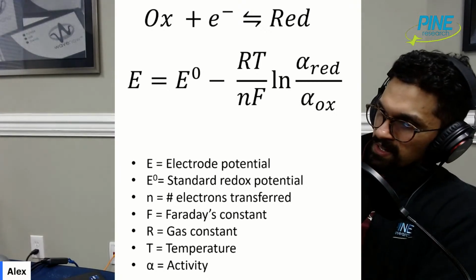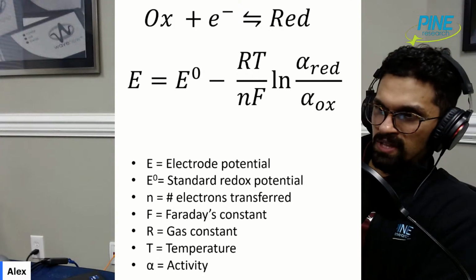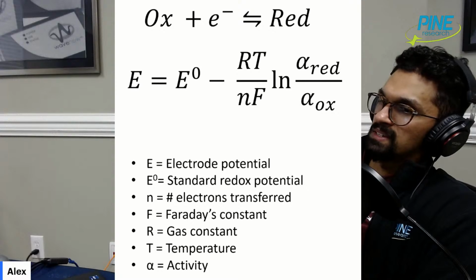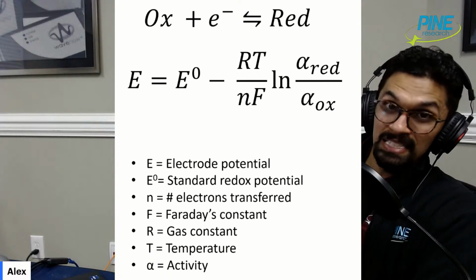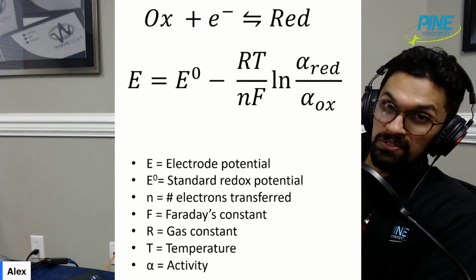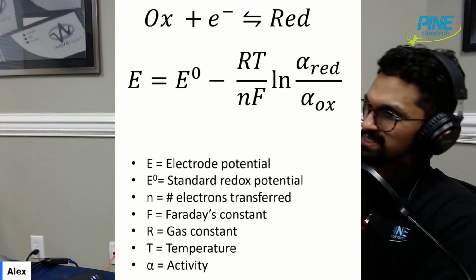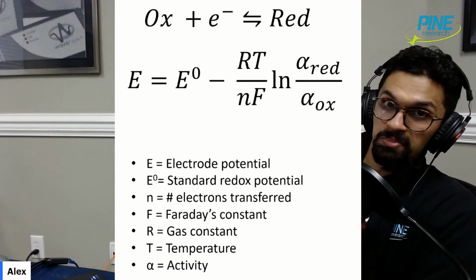So I don't know whether or not you're running into an issue like maybe a conductivity issue with your reference electrode. But 6 molar is actually okay. You can just plug that in.